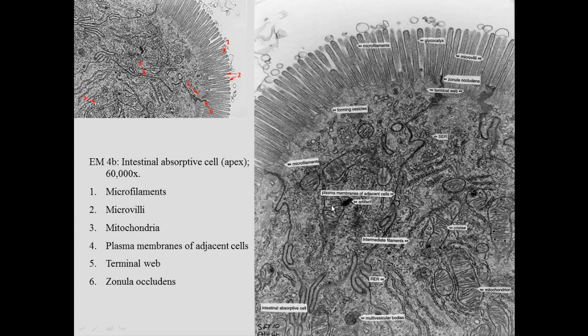If we see a higher magnification, we can see the mitochondria. There's one there, another one there, another one. You can see the cristae, nice cristae in these mitochondria. You can see a junctional complex. These are the tight junctions between two adjacent cells. Another junction in through there with desmosomes along the way, but these are the occluding junctions, so-called zonula occludens. And also you might note that these microvilli have microfilaments in through there.